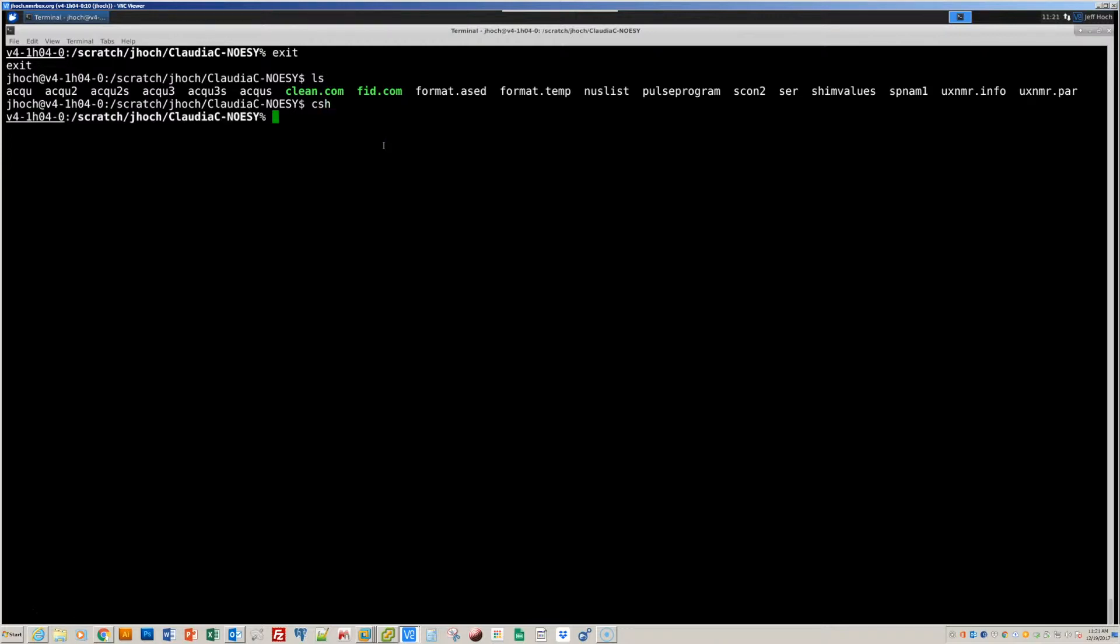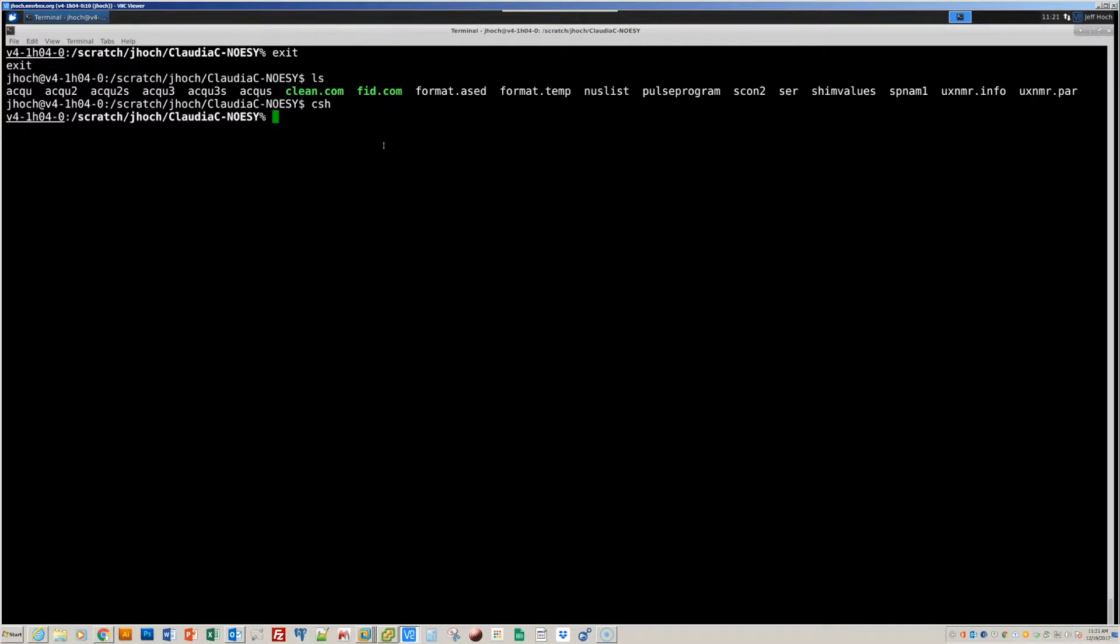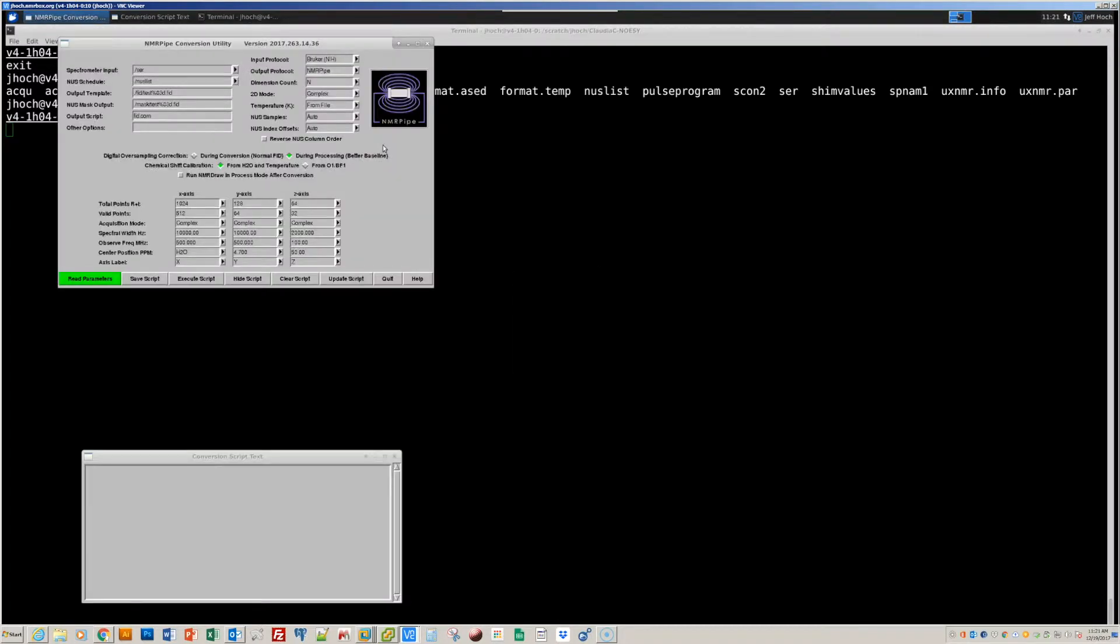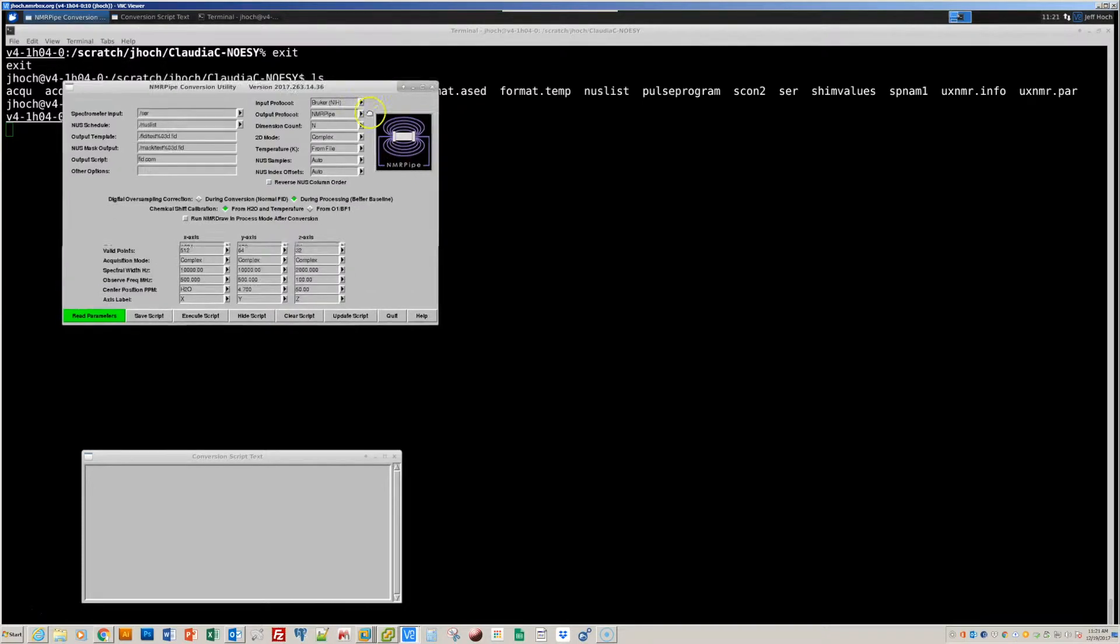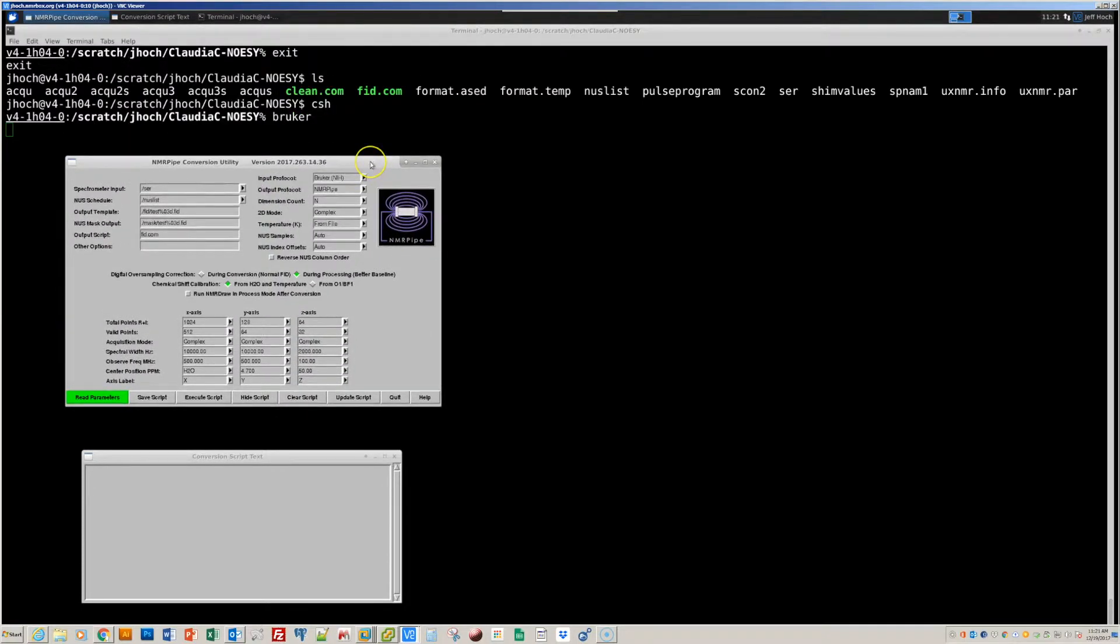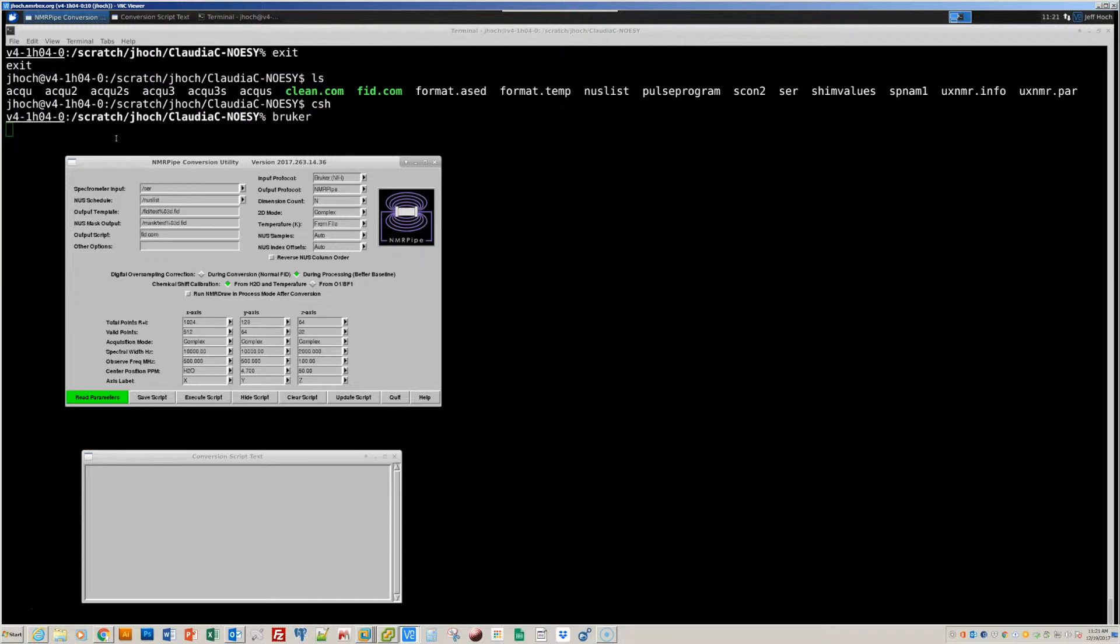In the NMR pipe workflow, the first thing that we do is create a script that converts data from the spectrometer format to the NMR pipe format. The graphical interface that we use to do this is called Bruker for Bruker data and, correspondingly, Varian for Varian data. This example is N15 edited NOE data recorded on a Bruker spectrometer. So I'm going to begin by typing the command Bruker at the command line. And that will give us this interactive graphical interface that will read the parameter files from the spectrometer format data and build a UNIX shell script that will convert the data into the NMR pipe format.